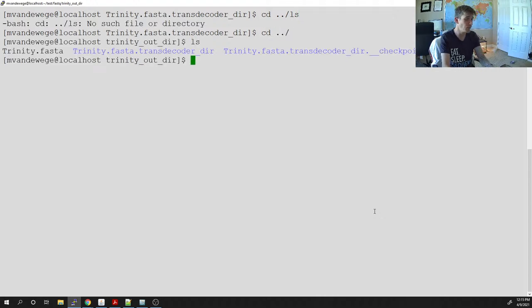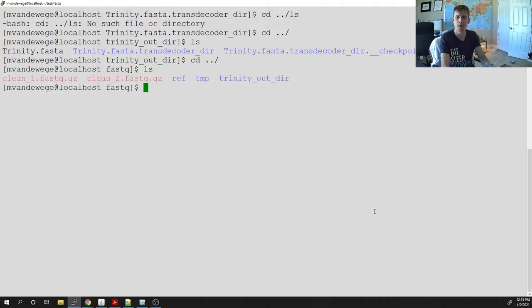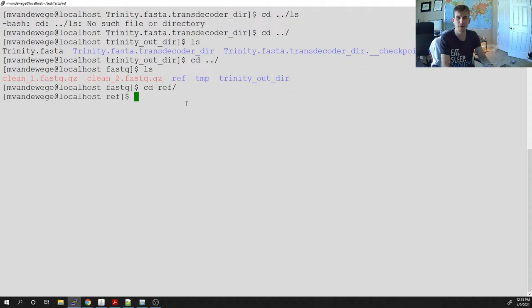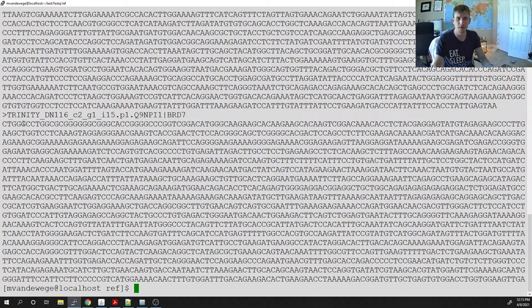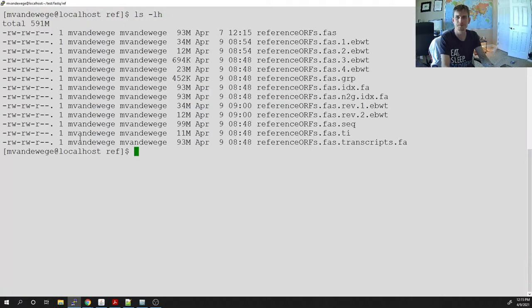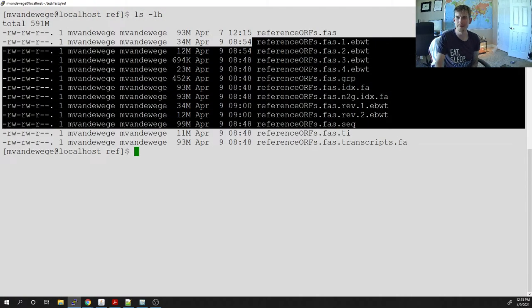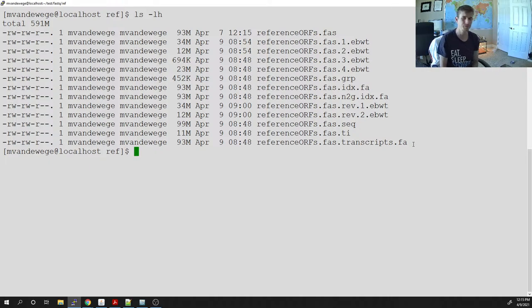I've already run these steps so we can at least see how to run the commands and look at the output. I'm in my raw fastq directory, I have my clean reads, and I created a directory called 'ref' where I moved my reference ORFs — my annotated ORFs. The command to create all of those files is 'rsem-prepare-reference'.